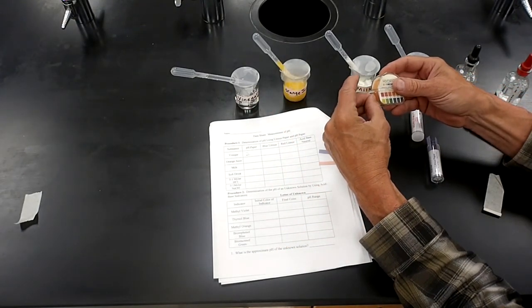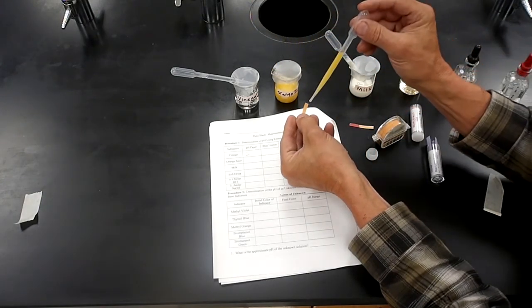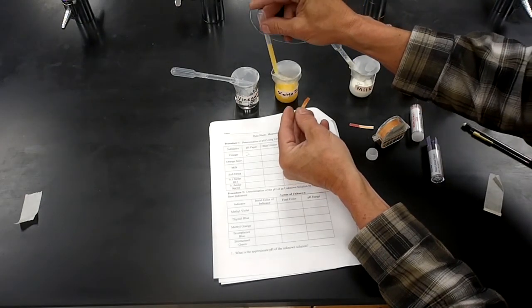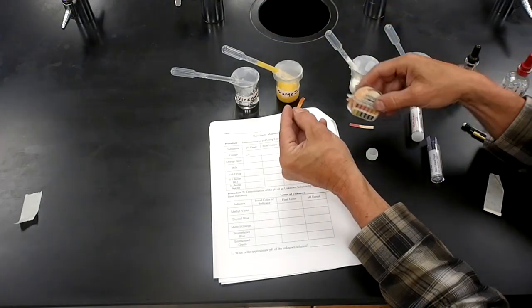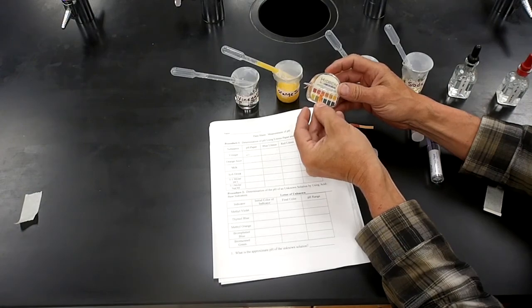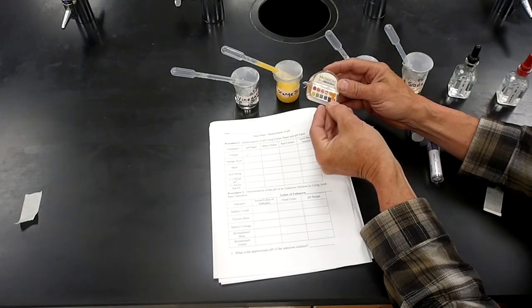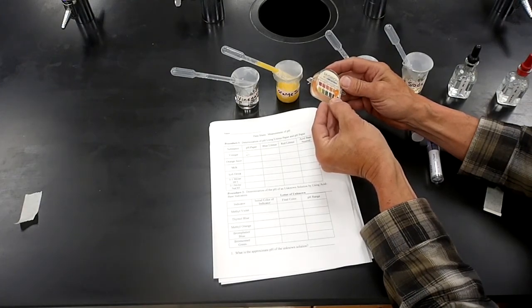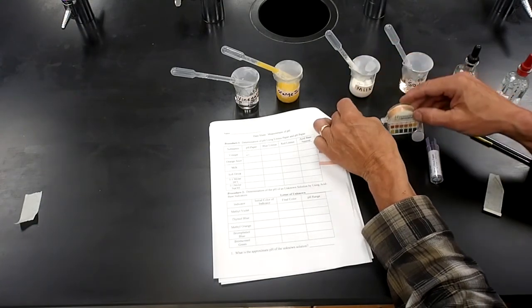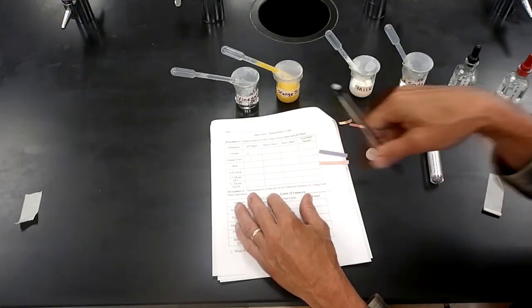Then I'll take the next solution, which is orange juice. Put a little bit of that on my pH paper. That one looks like it didn't change much. I'm going to call that about a pH of about 5, a little acidic. So I got a pH of 5 for the orange juice.